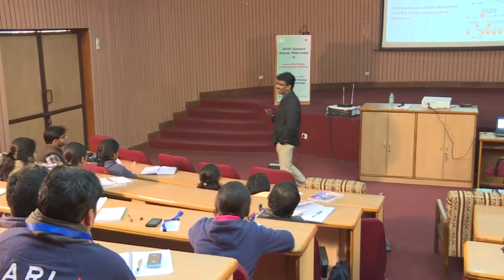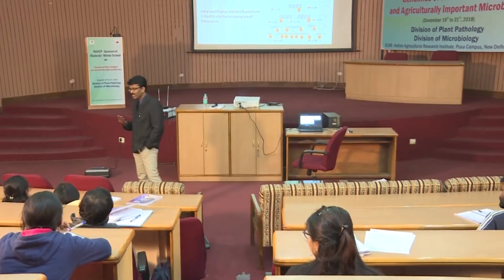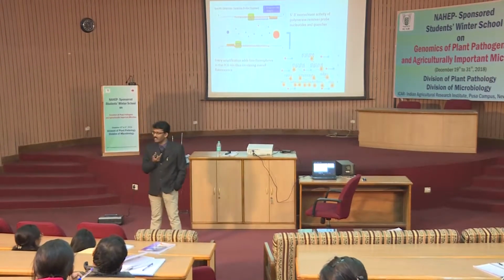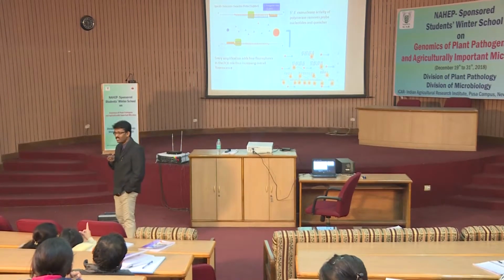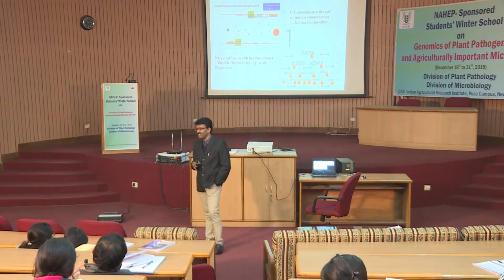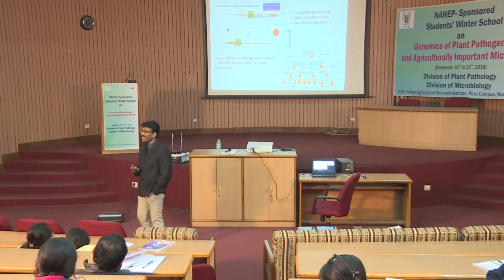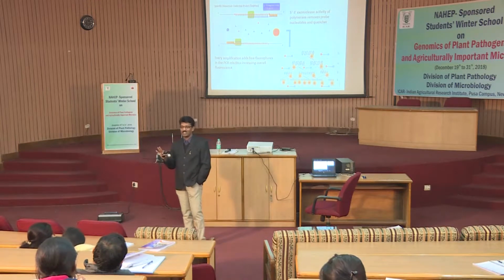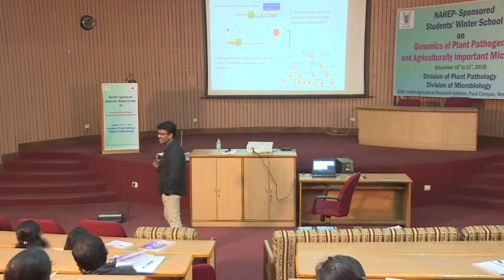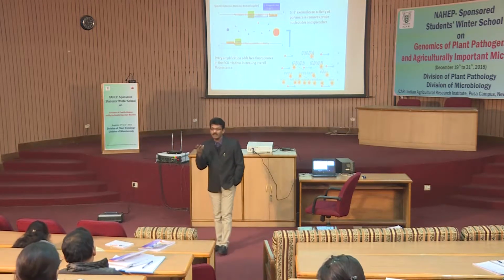But what we anticipate is the binding specificity of your probe and the primer is nearly equivalent. With the short nucleotide sequence of the probe, I'm sure even if such a probability is there, it is not going to hamper your experiment, right? I seriously doubt whether such things can happen. The majority of the templates bound with the primer means it is a successful PCR, right? We don't expect all the templates to bind with the primer. One or two mis-priming or no priming, it's okay, right? Anybody?